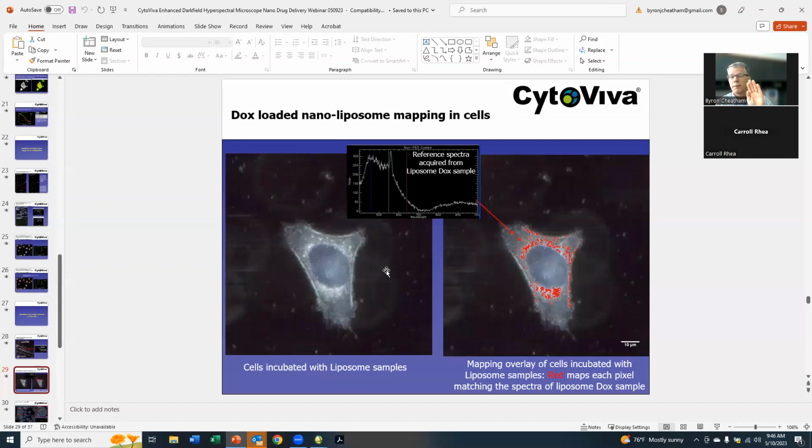Now, for the optical image, you can have the optical image on your microscope in literally seconds. It may take less than a minute from the time that you plate the sample, put it on the microscope, focus the microscope, and get the image. It's less than a minute typically, once you know how to use it.